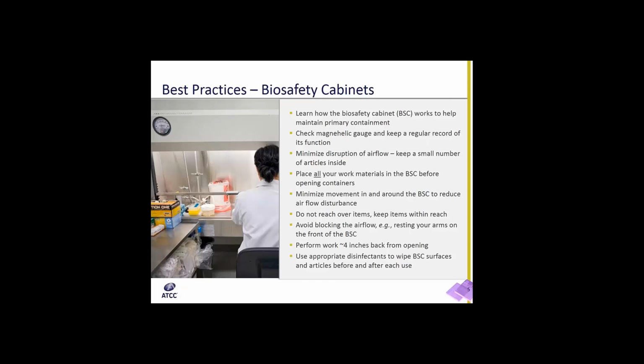So when you move your arms in and out of the cabinet, do it slowly and perpendicular to the face opening to limit disruption of the air current. Place all the work materials inside before opening any container such as media or the virus culture flask, and limit the movement in and around the BSC to reduce airflow disturbances.